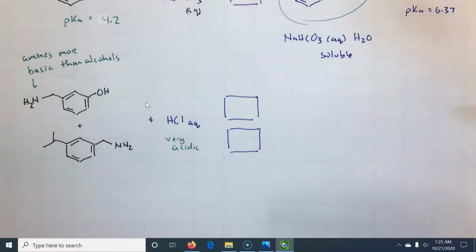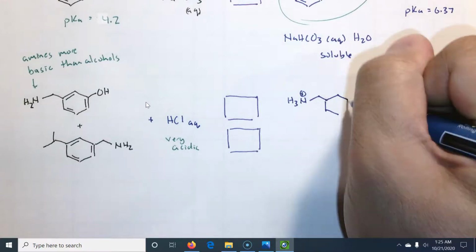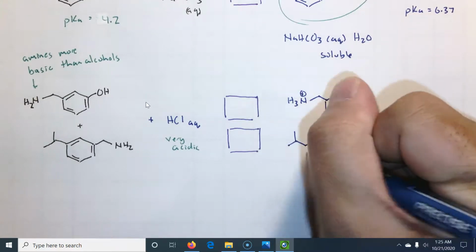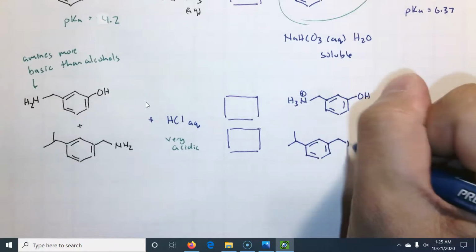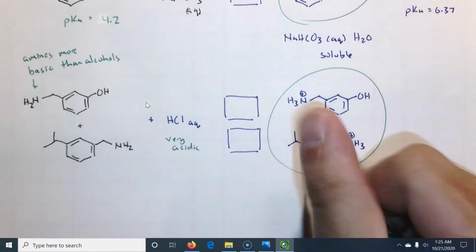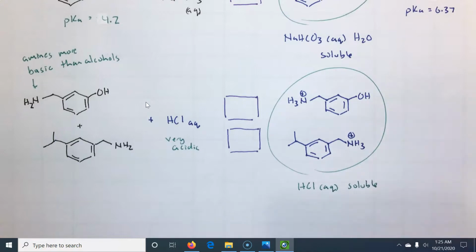Because of that, we have these two molecules, and this one. They're both charged. And why is that a problem? It's because now both of these will go into the water. Both of them are soluble in aqueous HCl. They're both in the water phase.